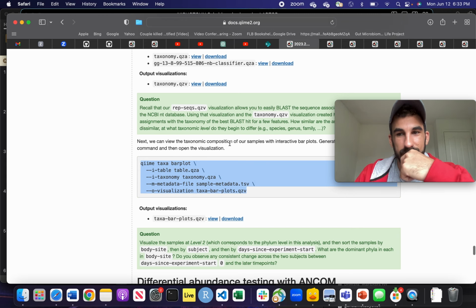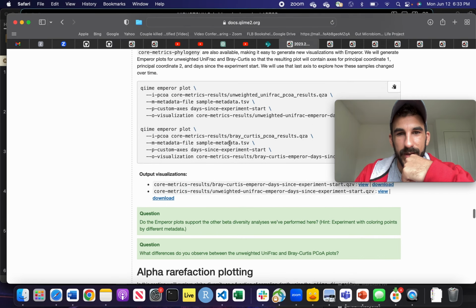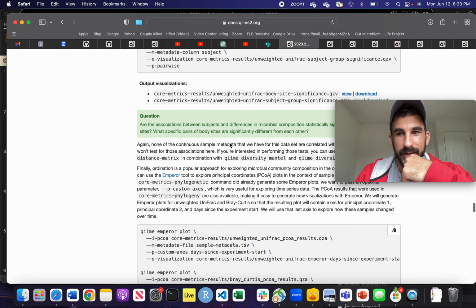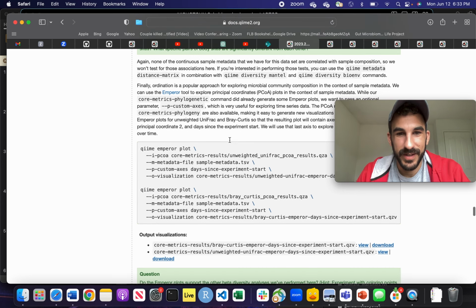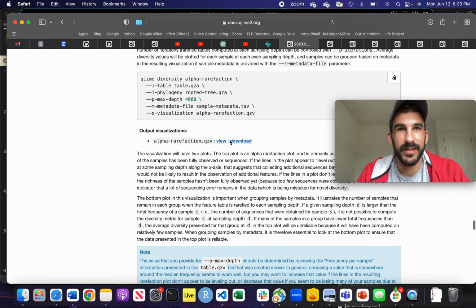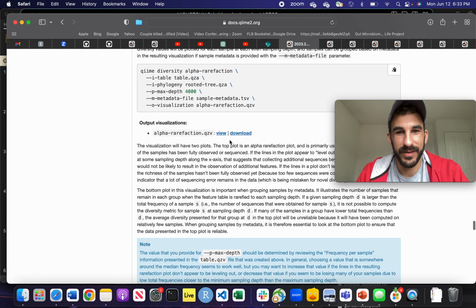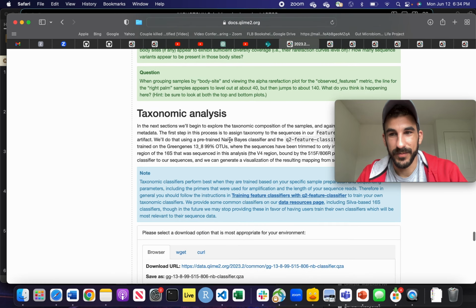So yeah, this is so incredibly easy, which is why some of you were saying that you want to try to get this done by the summer. You literally could do this on a Saturday, or during the week if you're trying to keep your summer Saturdays open. By the end of this video, you should already have the figures that you're going to need for us to have our next meeting and discuss what the next plan forward is for the paper. I'm pretty excited because we're going to get some very fast data.